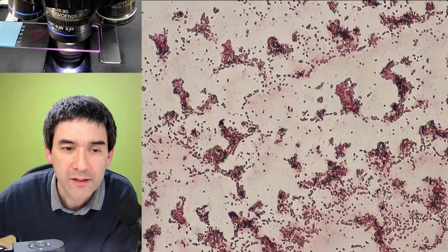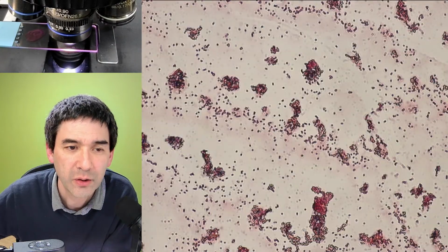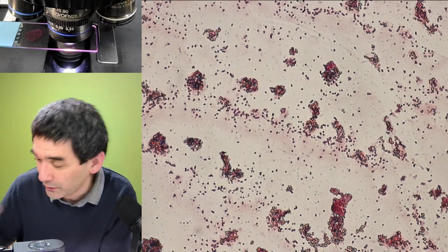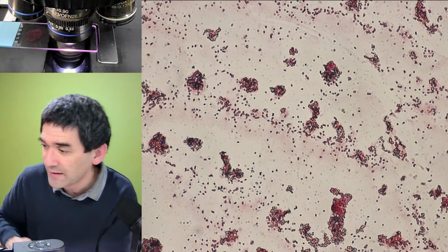Dental plaque, that's also an idea. Saliva contains a lot of bacteria, yeah. So, now let's do the following. Let's do a little bit of oil immersion microscopy, and I do have another slide here as well.